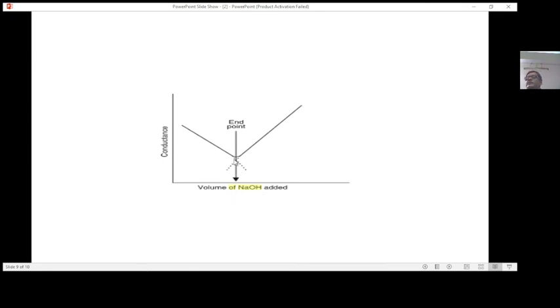After the addition, when there is no HCl left, due to NaOH, OH- has a strong conductometric value. This is why a V-shaped curve will be there. From this V-shaped curve, the endpoint is found without using the indicator, and from this endpoint you can easily convert the number of drops into a volume. So using V1S1 = V2S2 again we can get the strength of HCl.